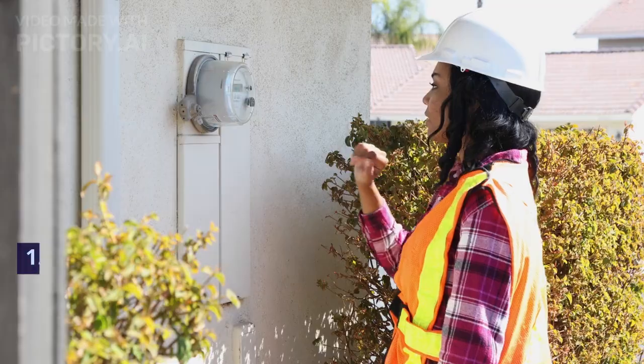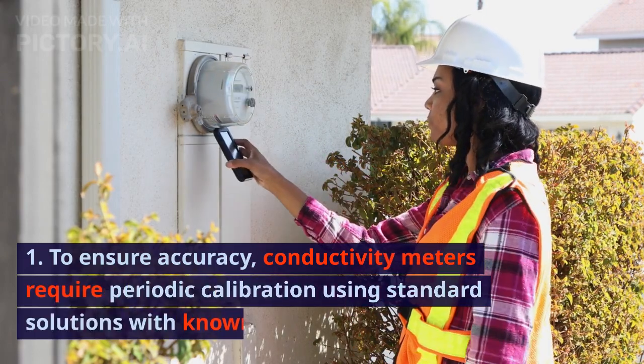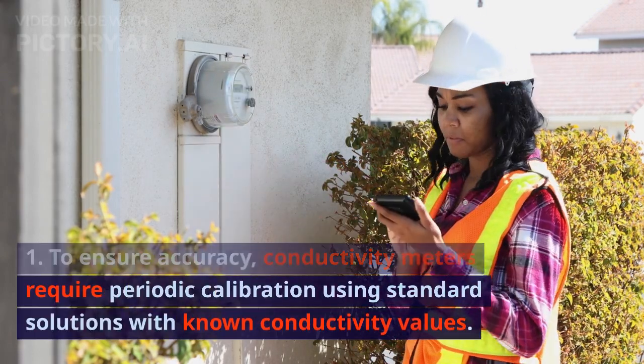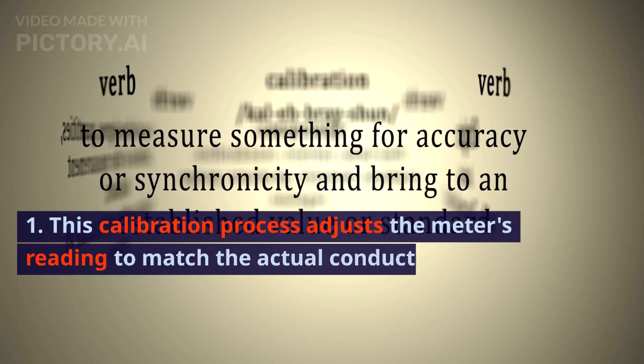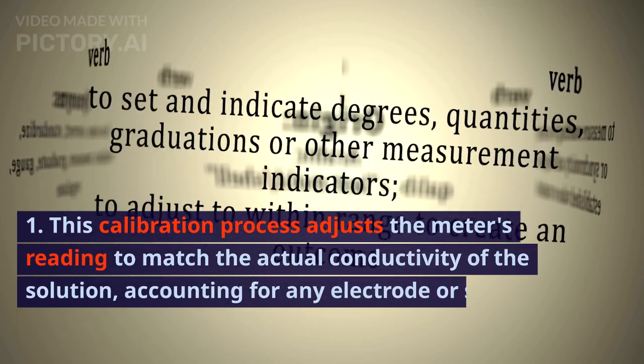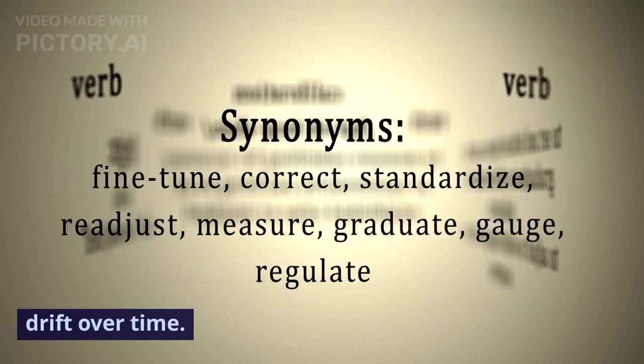9. Calibration. To ensure accuracy, conductivity meters require periodic calibration using standard solutions with known conductivity values. This calibration process adjusts the meter's reading to match the actual conductivity of the solution, accounting for any electrode or sensor drift over time.